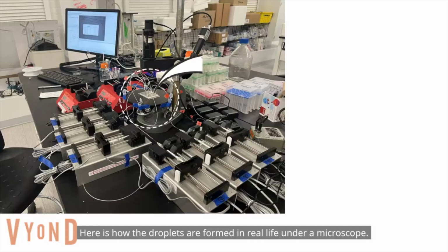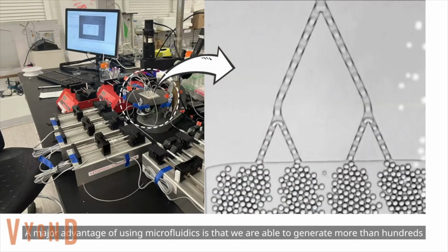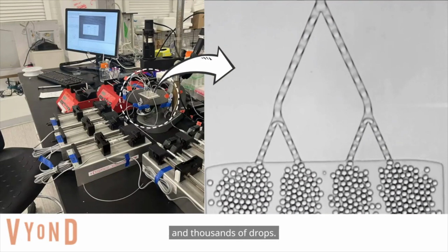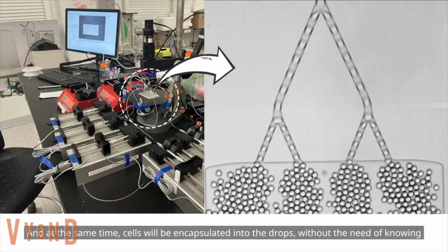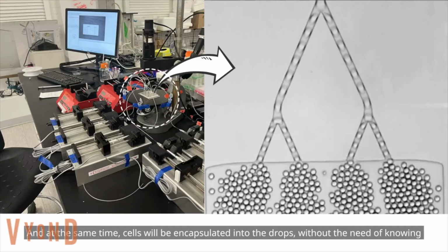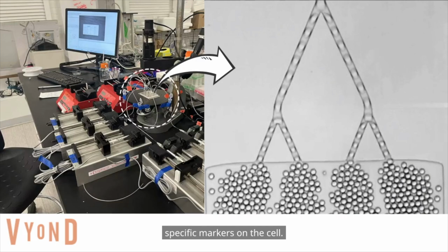Here is how the droplets are formed in real life under a microscope. A major advantage of using microfluidics is that we're able to generate hundreds of thousands of drops. At the same time, cells will be encapsulated into the drops without the need of knowing specific markers on the cell.